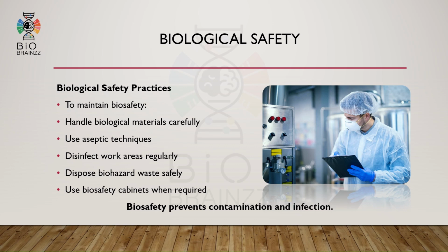Biological safety, also called biosafety, focuses on handling biological materials safely. Laboratories working with microorganisms and biological samples must follow strict precautions. Important practices include using aseptic techniques, disinfecting work areas, safe disposal of biohazardous waste, and using biosafety cabinets when necessary. Proper biosafety reduces contamination and infection risk.